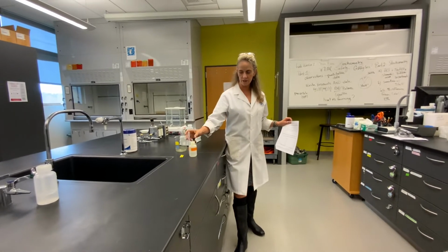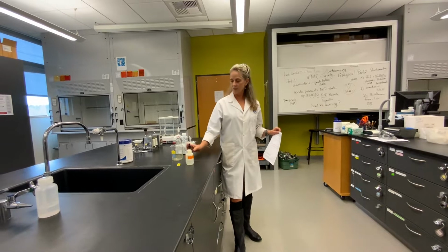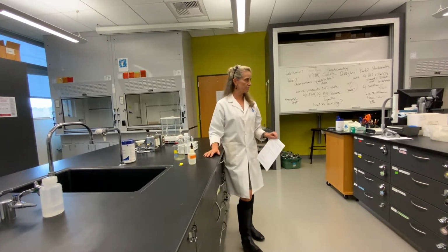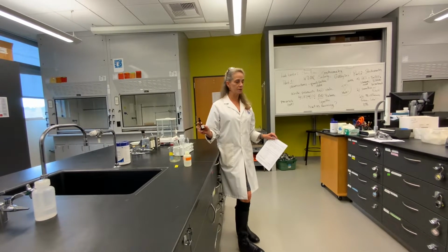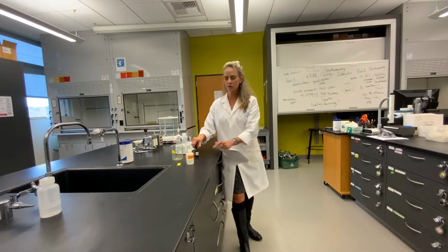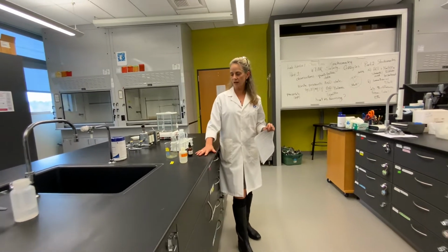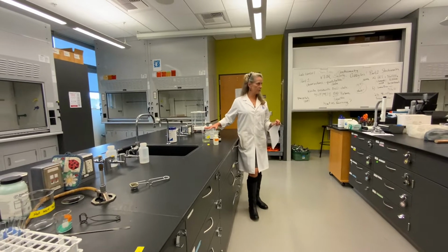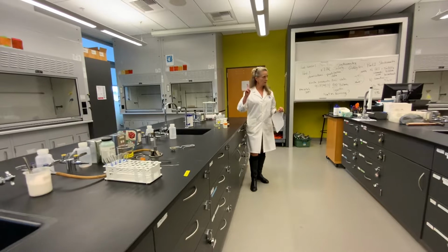Scott makes it so easy. When you're done, put it in the little container, and you don't have to get contamination. And that's because you'll get this precipitate in the containers if you get them contaminated. This is where you're gonna put the 2 to 5 drops of, this is lead nitrate. And so basically, make sure you screw the tops back on when you're done too. That's always good. All right, so that's the first reaction. Waste goes in the waste jar, and then you can rinse the test tube and put it back in the test tube rack, okay?